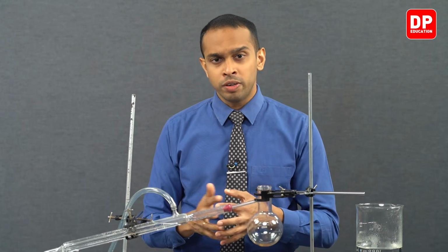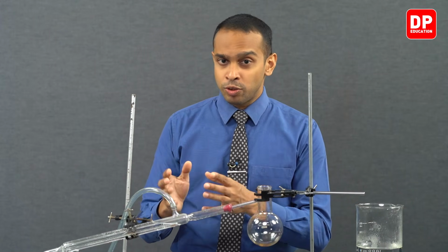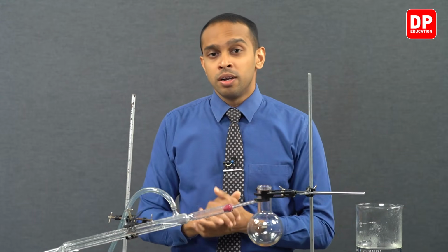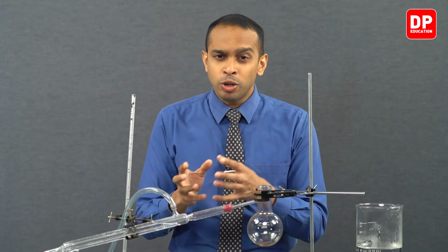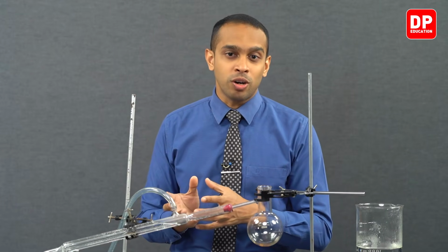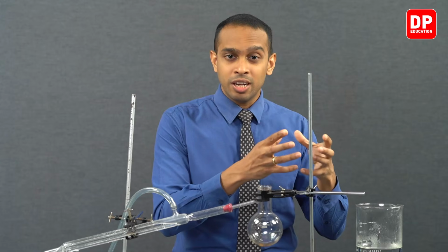So through the solvent extraction method, majority of the essential oil that was present in water was extracted into the diethyl ether layer. This extraction was only possible because the essential oil was more soluble in diethyl ether than in water. That is why the essential oil got dissolved more in the diethyl ether layer.